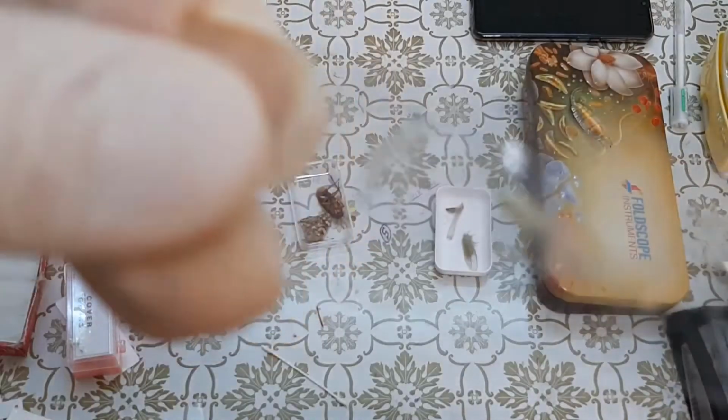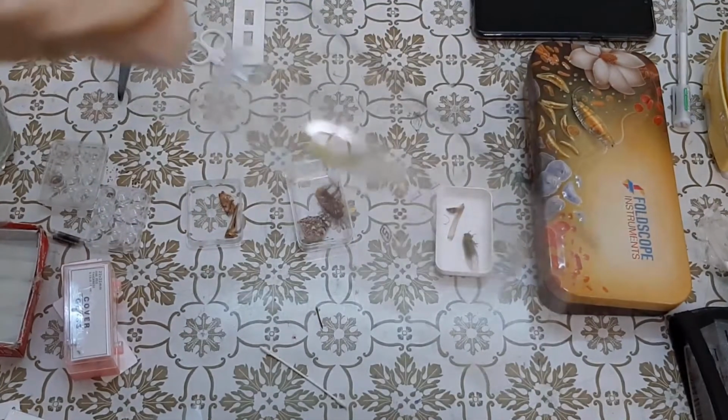This is in a slide because I wanted to keep it and save it from any damage. So this is the wing and the body, and the thorax and the abdomen, as we saw earlier. This one is called Neuroptera.